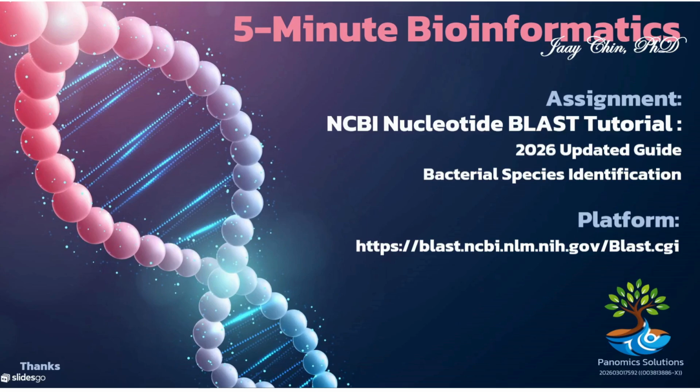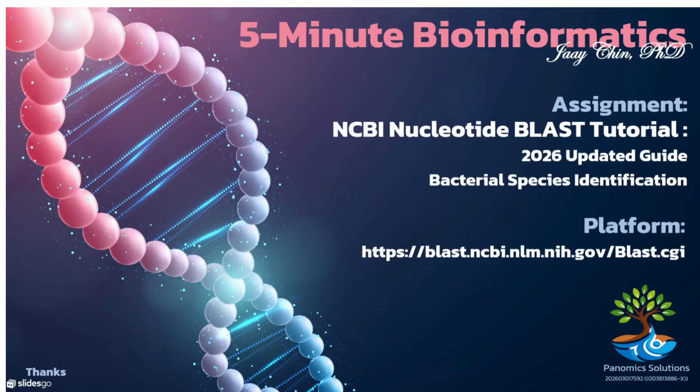We'll cover every step, from pasting your sequence into BLAST, selecting the right database, to interpreting the results, so you can get accurate matches without any confusion. Even if this is your first time using BLAST, you'll be able to follow along easily and start identifying bacteria right away.